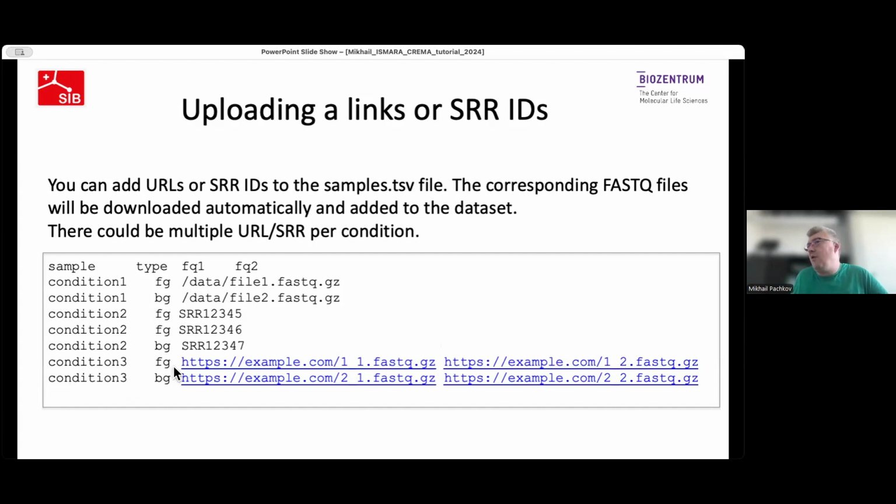And the same way you can add links instead of file paths, and like ISMARA, CREMA is going to automatically download files either from a database or from the internet, and once the upload is finished, it will run the analysis.